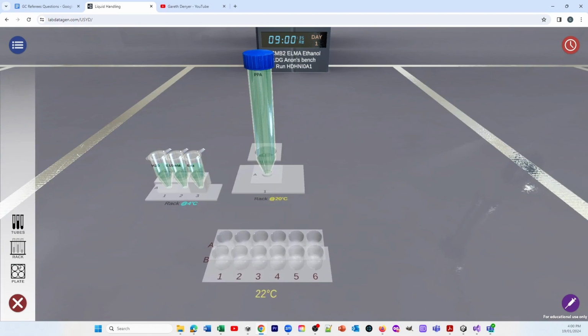And a particular use of this is often in assignments. One very important assignment, students determine the concentration of ethanol in some samples of blood that have been provided by drivers that have been accused of being over the limit.